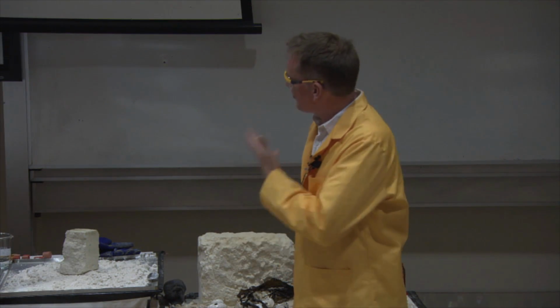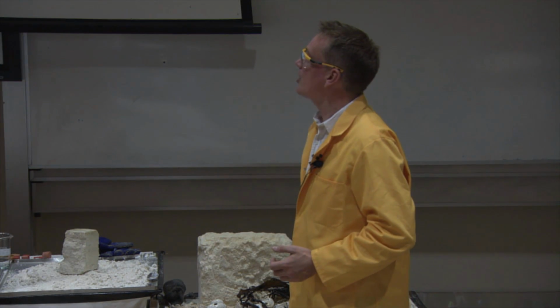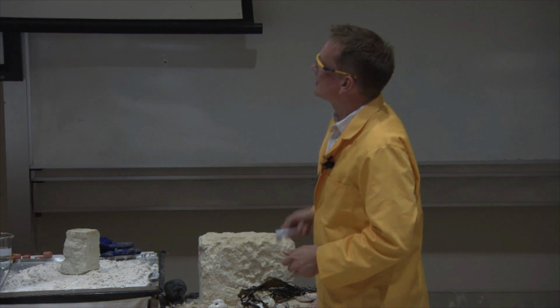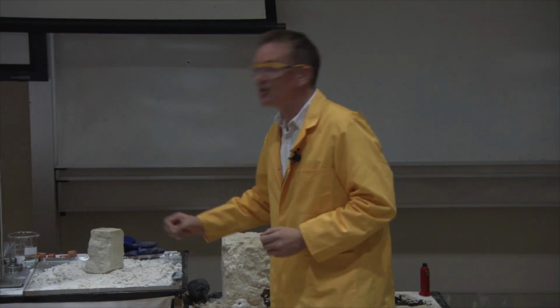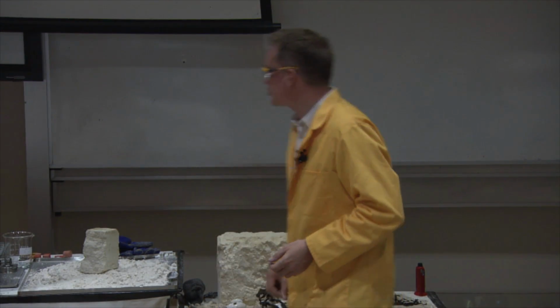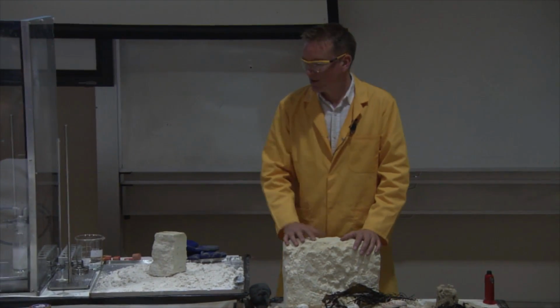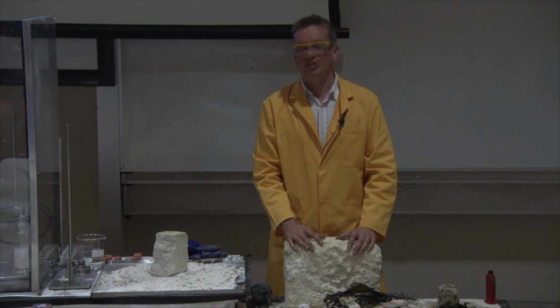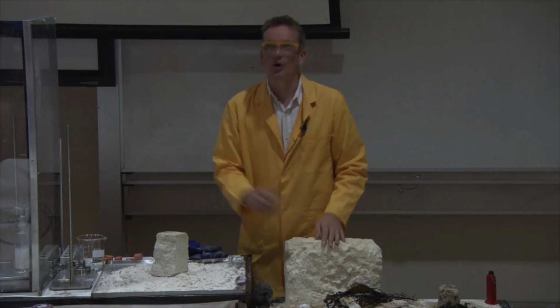So we've heated up the calcium carbonate and driven away the carbon dioxide, and what we've made is calcium oxide. So heating up calcium carbonate drives out the carbon dioxide and leaves behind calcium oxide. Now, it looks just the same though. How would you know? Well, one way you know is this is quite a bit lighter than this one. Because we've driven out the carbon dioxide, it's not as heavy per the same volume. If we had the same volume of this block and that block, this one would be lighter.